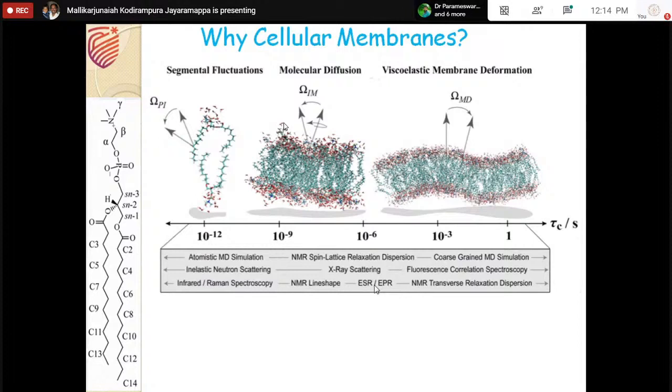All these kinds of minute information one can extract from NMR compared with X-ray. It doesn't mean that it is superior over the other technique. Some of the things X-ray can do, NMR may not be able to, but NMR gives both structural information as well as dynamical information of a given system, is my bottom line.